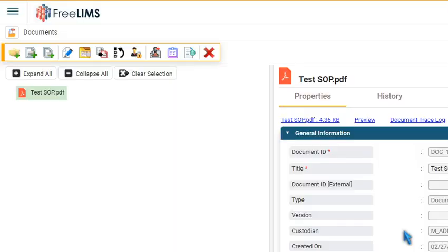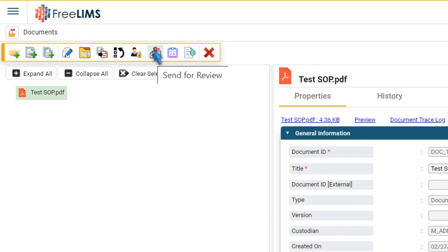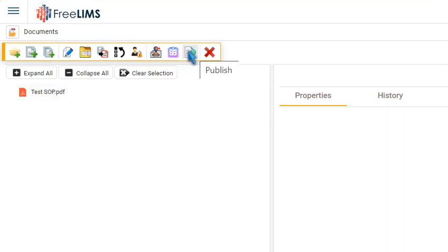Subsequently, send the document for review using the Send for Review icon. Once it is approved, click the Publish icon to publish the document.